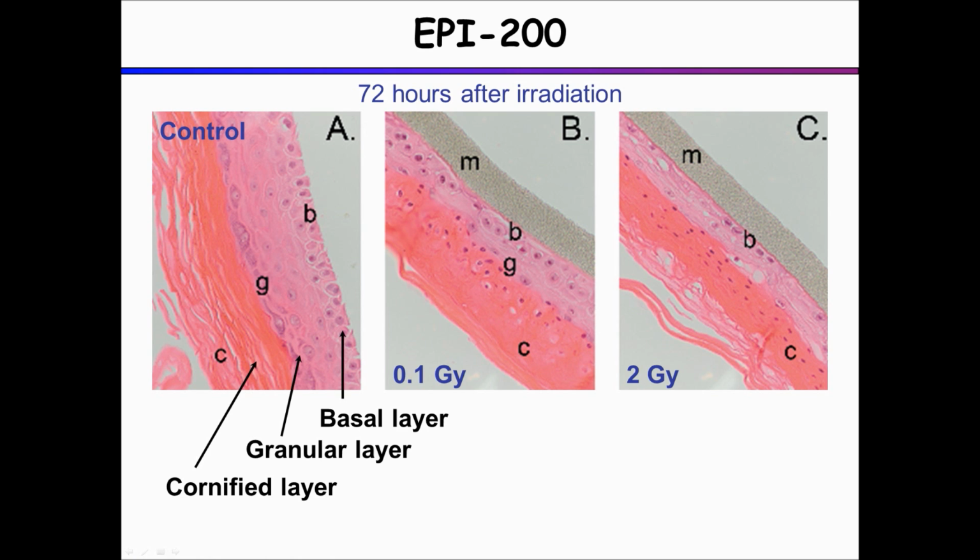So this is just showing unirradiated skin tissue, and in this slice, unfortunately, the membrane should be right here. It's peeled away, but this is the basal layer that you can see, very nice, tightly packed nuclei, well differentiated, coming up through the granular layer here. And then very clearly you can see this cornified layer, which is mostly keratin as the cells become terminally differentiated.